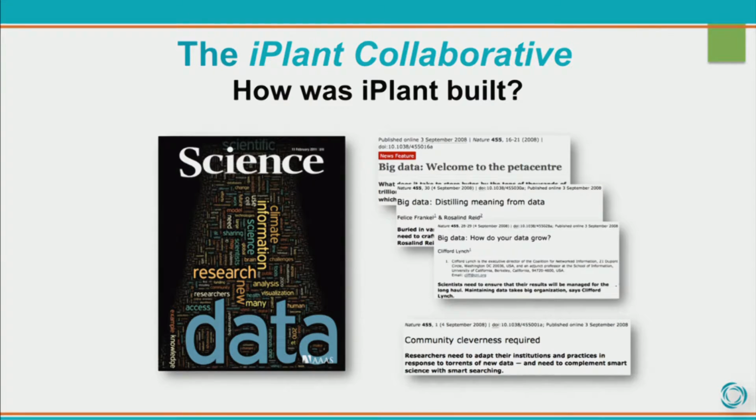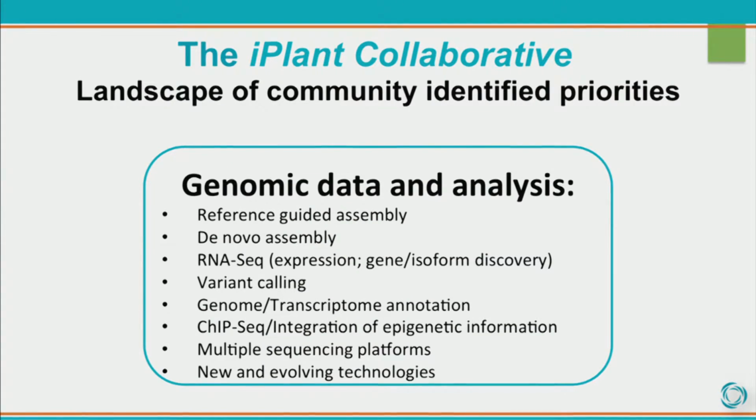How is iPlant built? This is also important for you to know. Really, at the beginning of it, we knew that we couldn't just come up with all the solutions ourselves, but that it was going to be a community project. So we spent almost the first year and a half, almost 2 years, on intensive requirements gathering, and what we learned from the community is very much what I think you'd expect. Genomic data has definitely been the big driver of data-intensive biology. So when you come to iPlant, you will definitely find tools for doing genome assemblies, RNA-seq, variant calling, ChIP-seq, a whole entire platform set up for working with genomic data.